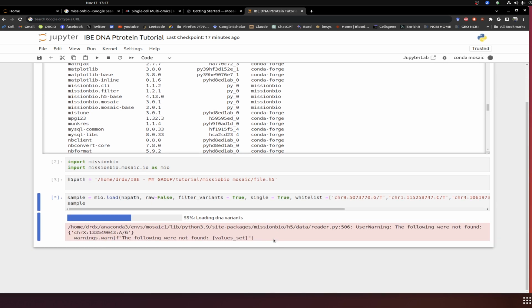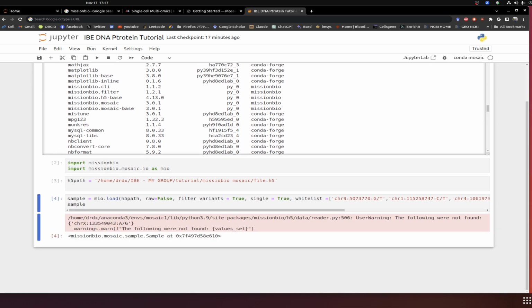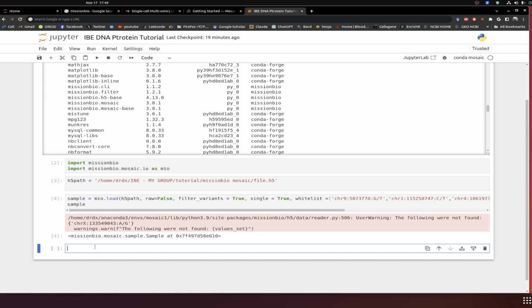So you can see this is loading our samples. So the samples are loaded. And now if you require, like, I want to see some more information, a little bit more information from here, we will go through the extensive analysis from the basic filtering to everything. You can write something like that.